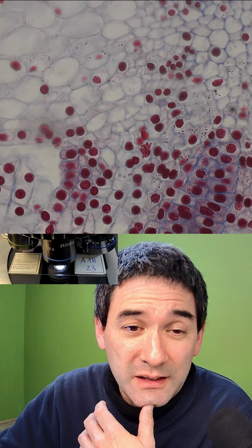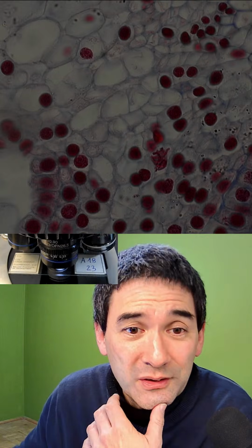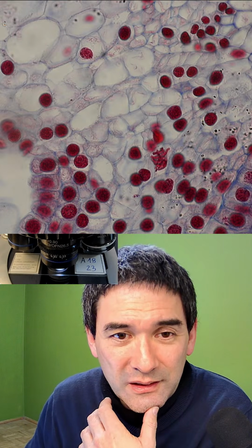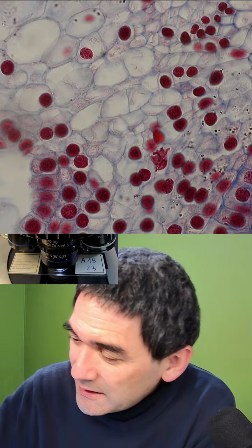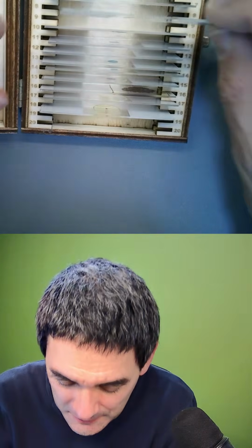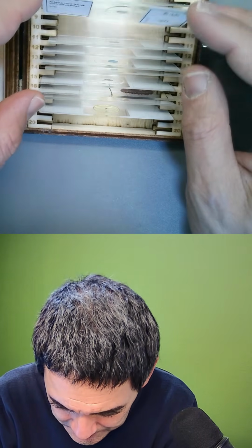Oh, okay. Here again in the center, some chromosomes. Need to turn up. Yeah, here again. So that's also one of the slides that I like, and where I've made some pictures, and then I frame them and hang them up in my room. This takes me longer than I actually anticipated.